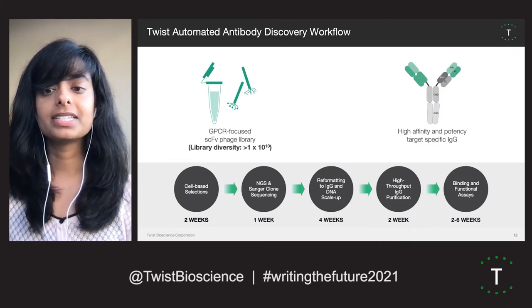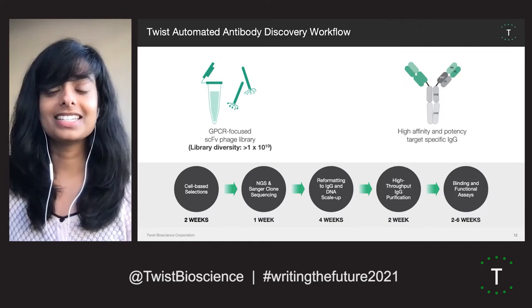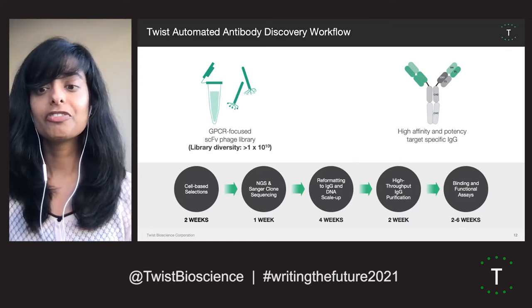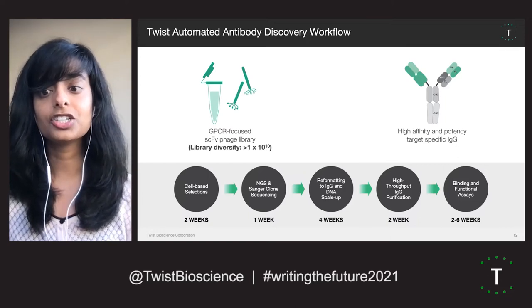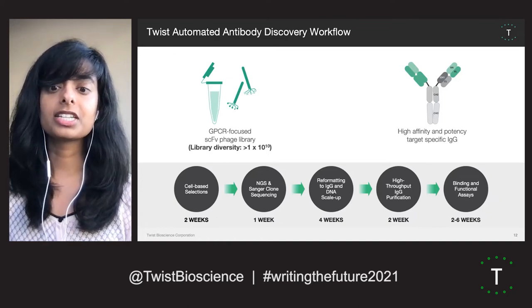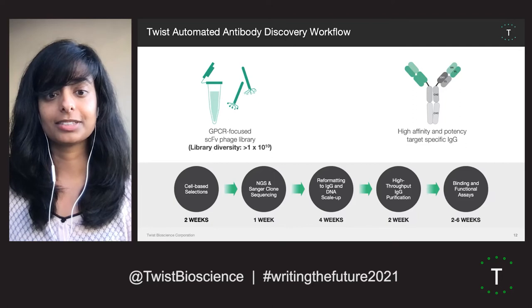We then followed up and did NGS and Sanger clone sequencing. Because we sit inside a DNA synthesis company, we don't mess around with antibody fragments. We very quickly reformatted them and made the genes encoding the full-length IgG antibodies. We then expressed and purified them to make the physical antibodies. Finally, we did downstream binding and functional testing.